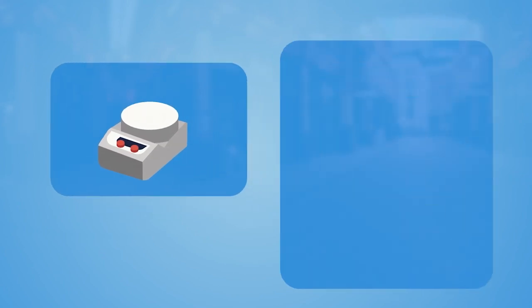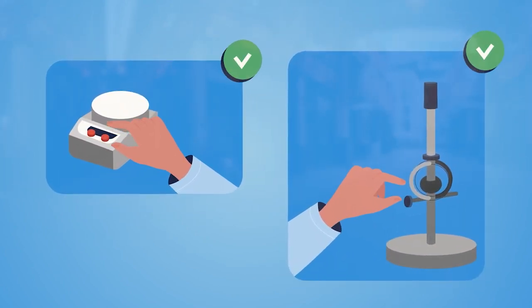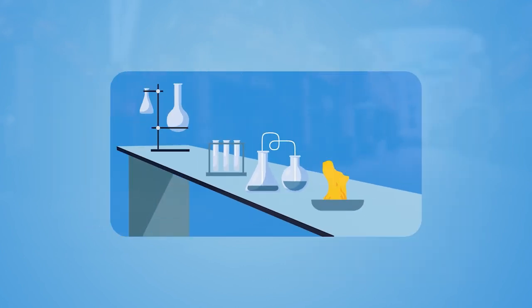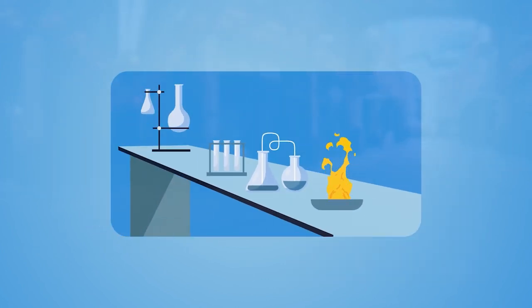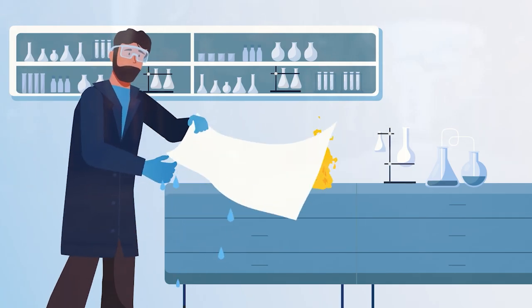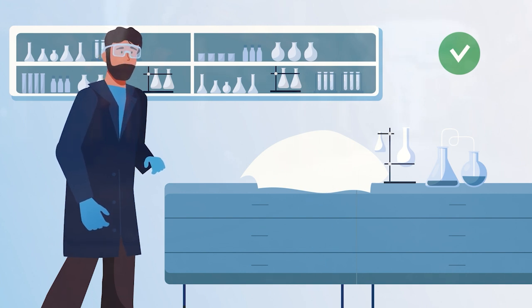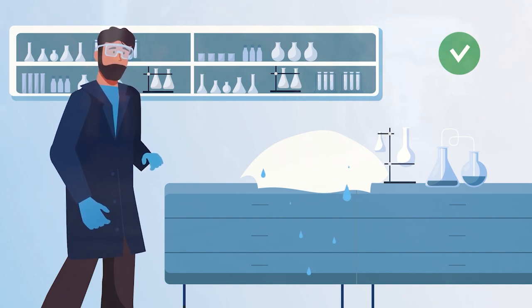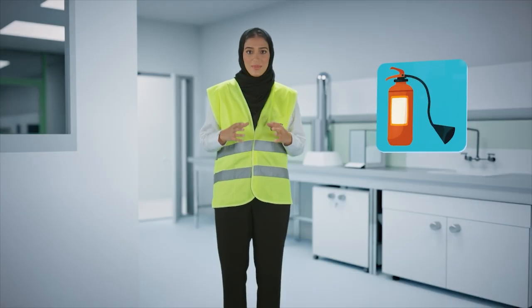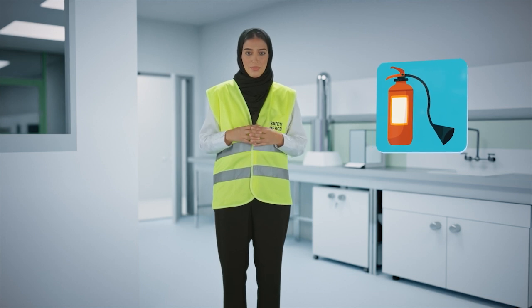Remove the heat source by turning off the gas supply to a Bunsen burner or unplugging the electric heater. A fire contained in a small vessel often can be suffocated by limiting the air oxygen. Never use dry towels or cloths to cover the fire because these will burn to add fuel. You can use a wetted material if available. If the steps listed above are not practical or do not extinguish the fire, a fire extinguisher may be used.